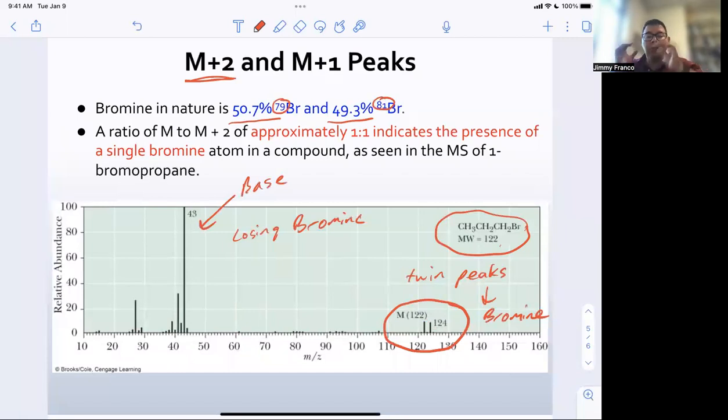Right? And so this is how we can start to get information out of our molecule. Yes, these peaks are great because they'll show us the molecular weight of our molecule. And so that would actually tell us, yes, we made that molecule, we can match up that mass, but it also tells you that you did a bromine, right? So that you have a bromine in your molecule.